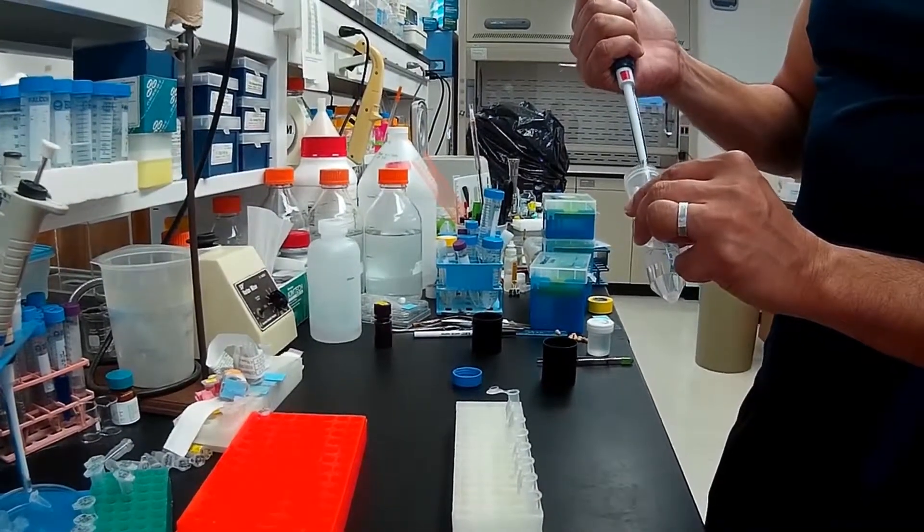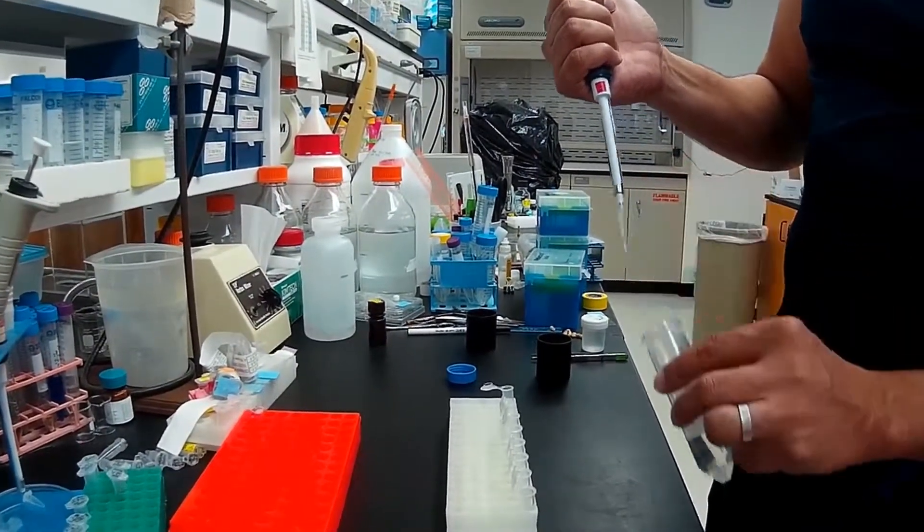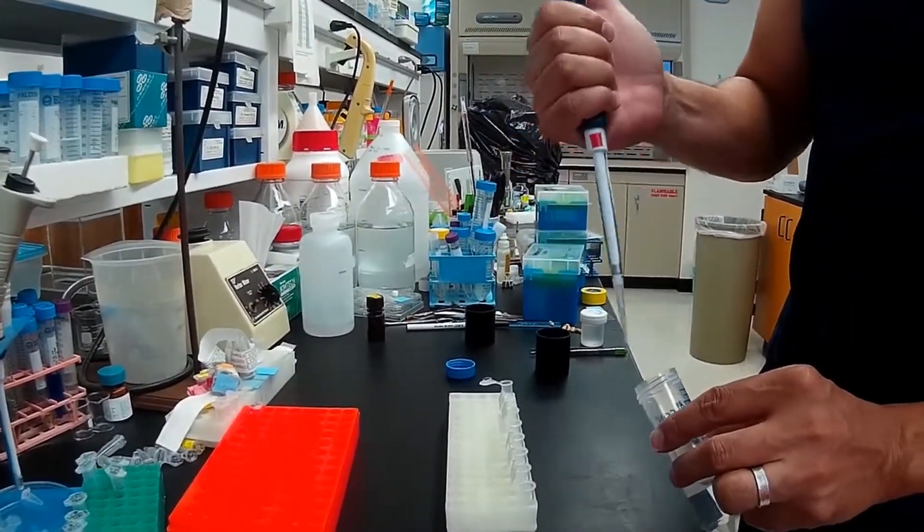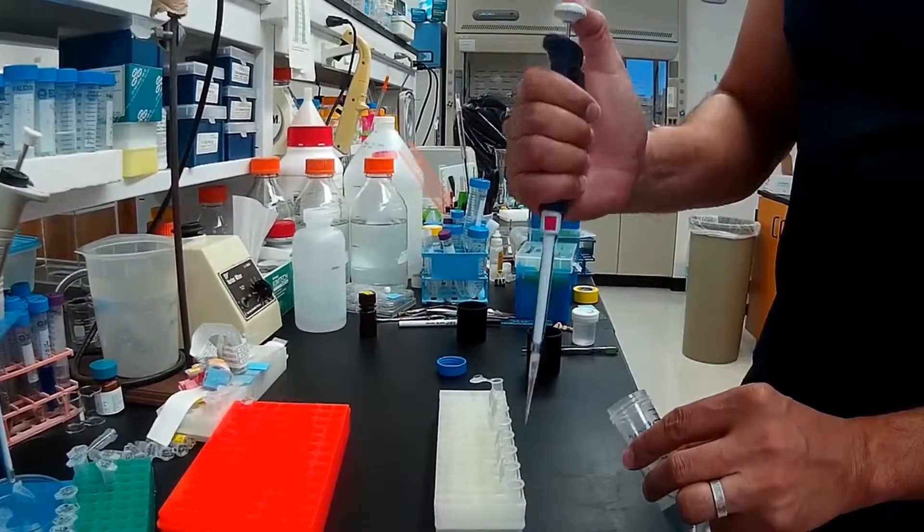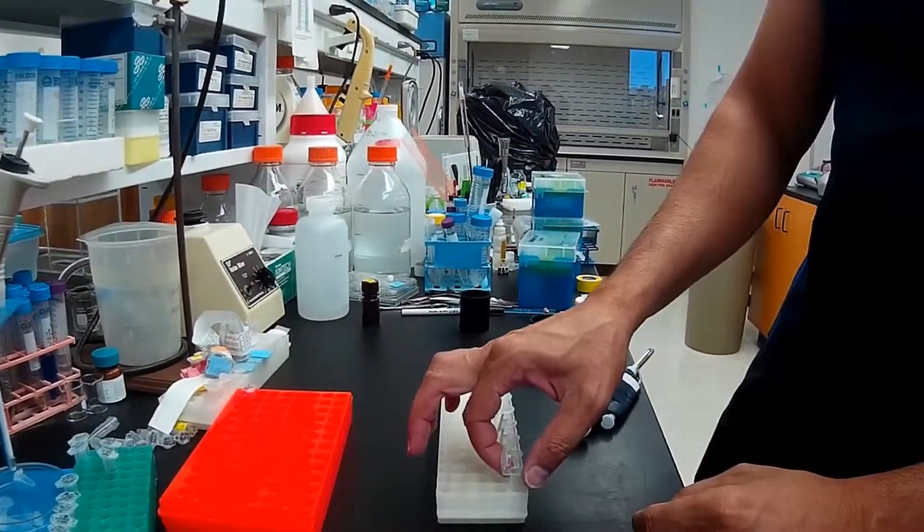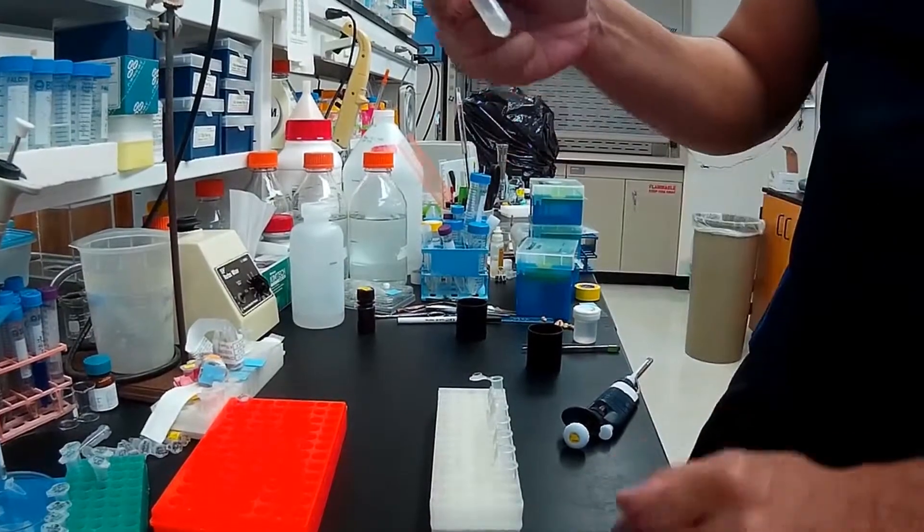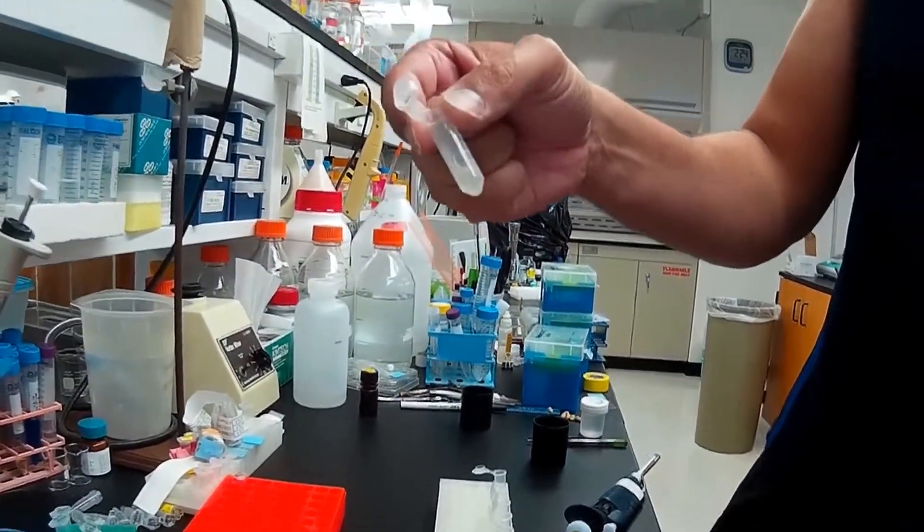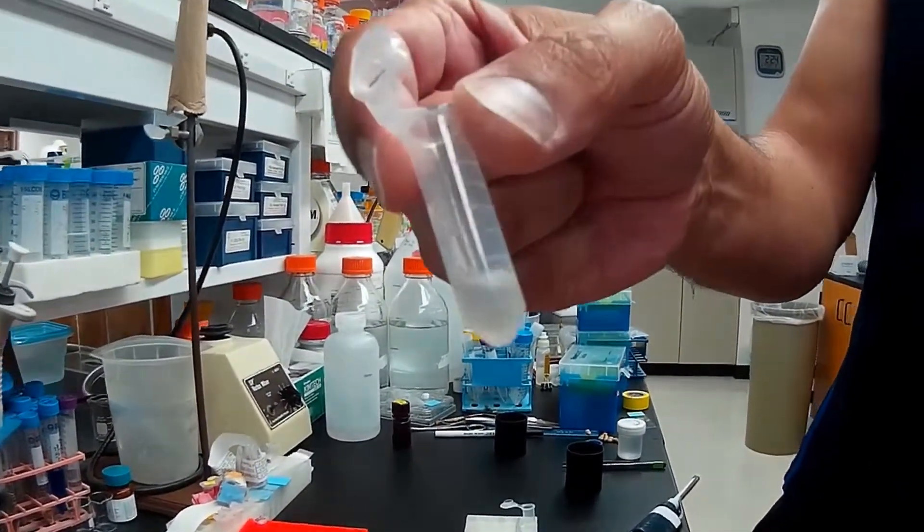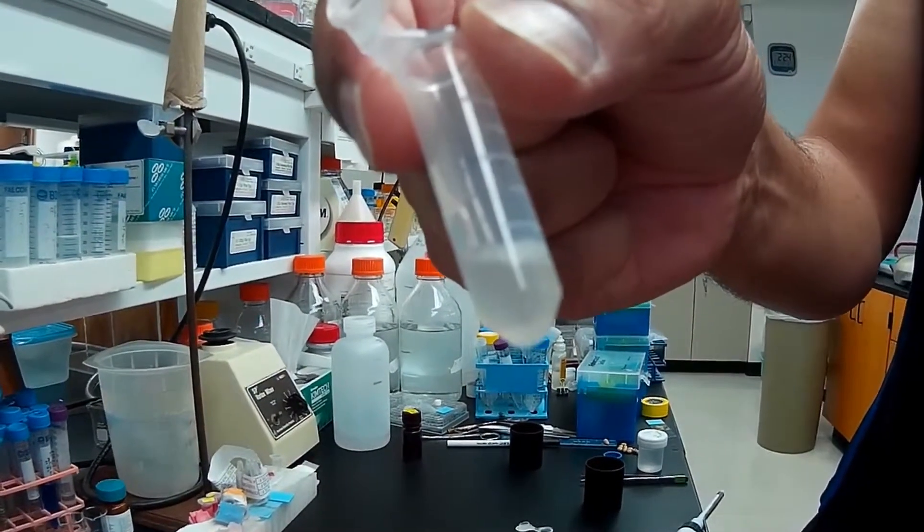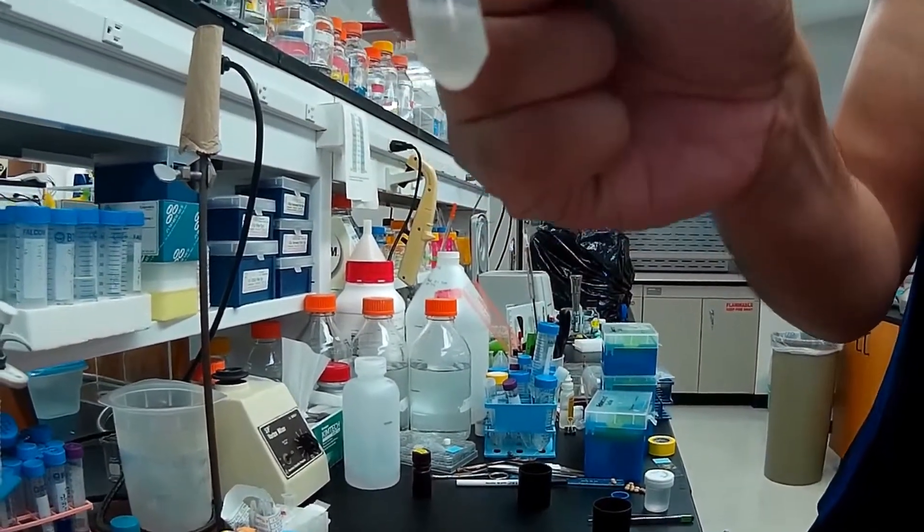Next, we'll add 200 microliters of solution two to the re-suspended E. coli that will lyse the cells. Mix by gentle shaking. You should not shake hard at this point. It should be gentle and you'll see a clear lysate. The lysate will become slightly clearer.